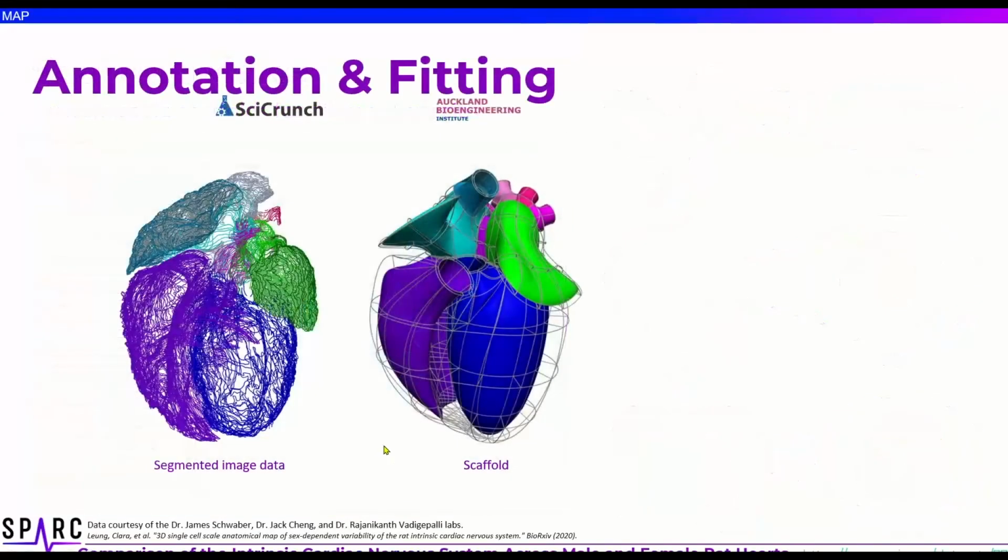Thanks, Mabel. So as part of the scaffold mapping pipeline, we have developed tools to customize our scaffold to individual datasets. Scaffolds contain distinct regions and landmarks, annotated with standard anatomical terms based on the ontologies provided by the SciCrunch infrastructure from the FAIR Data Informatics Lab at UCSD. We work with the researchers who produce the data and our colleagues at the MBF Bioscience to ensure that scaffolds and data have the required corresponding annotation. This allows for an easy and automated registration of data to scaffolds.